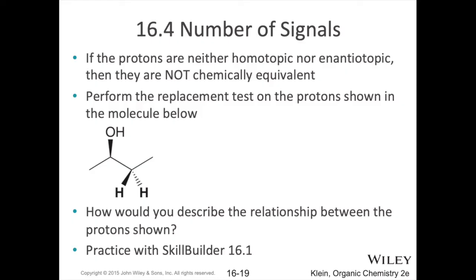different NMR signals. Okay, so if you have a molecule and you're trying to figure out what the NMR spectrum for this molecule will look like, it sometimes helps to look at those protons and ask yourself, how many signals should I see for this molecule? Okay, and then accordingly, when you're shown your NMR spectrum, you can see if that matches up with your expectation.